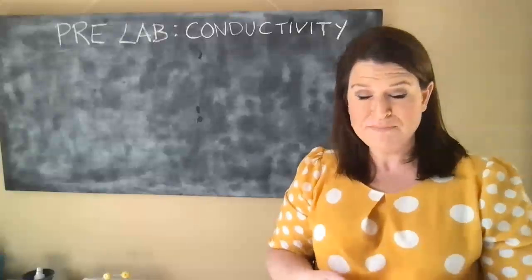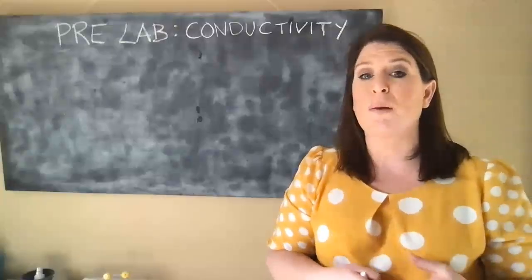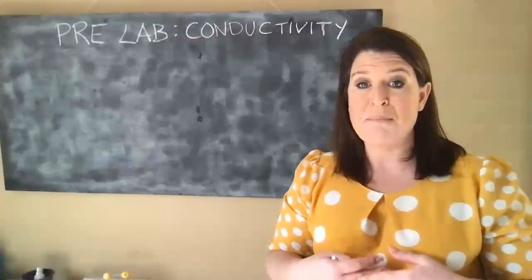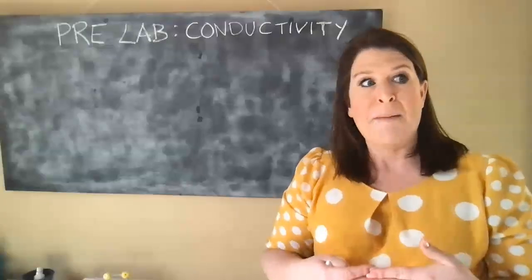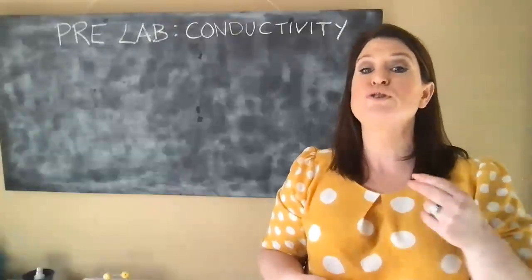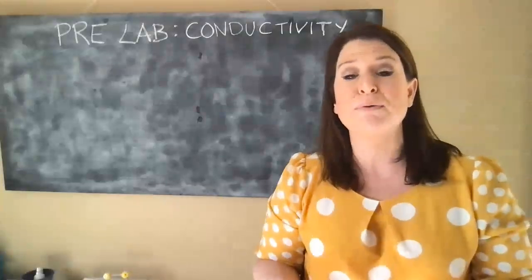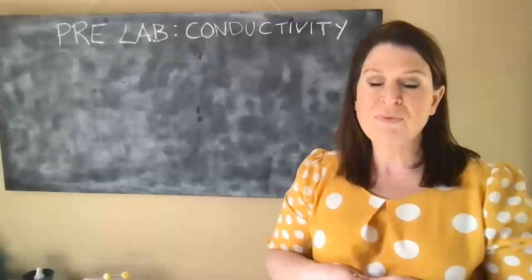We're going to do a titration which is a little bit more advanced than the titrations maybe you've done before, because unlike previous titrations where you've titrated an acid against a base and gotten an endpoint, here we're going to take a mixture of two separate acids, and using the behavioral patterns that we see due to the conductivity, we're going to be able to determine not just one endpoint but two endpoints, and determine the concentration of two separate acids in the same solution, which is something we wouldn't be able to do using something like an indicator that you might have seen before.